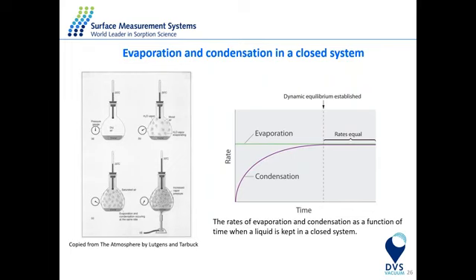So the rate of evaporation is almost non-existent. Now, if we set the temperature to 20 degrees, the rate of evaporation will increase.